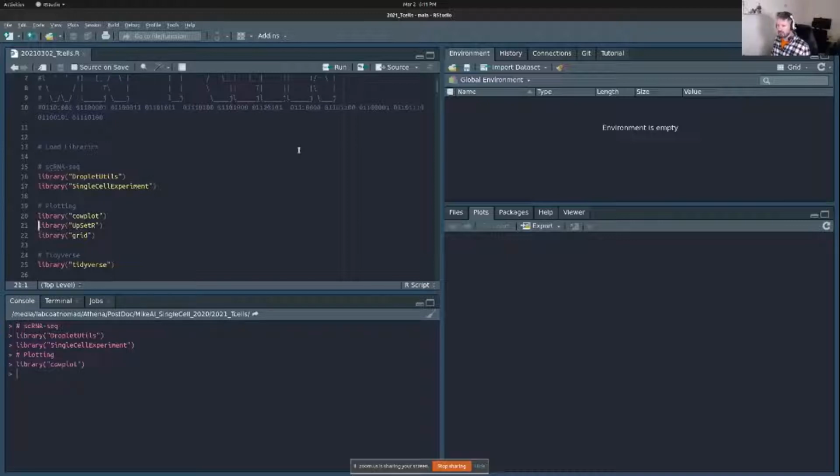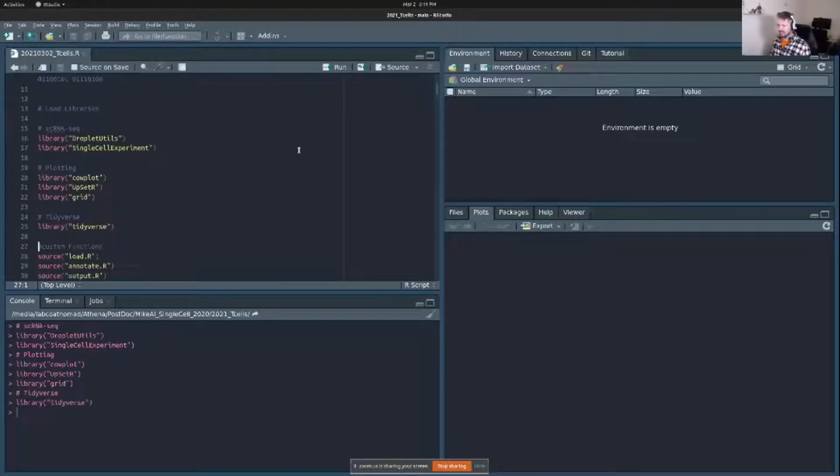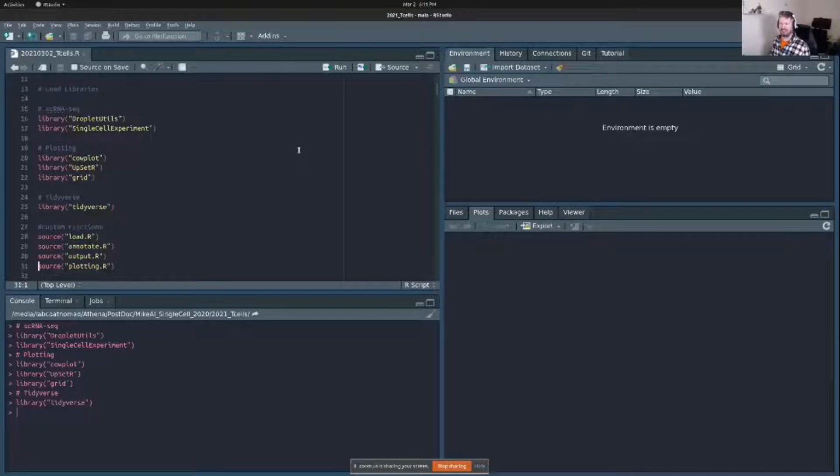You can use cowplot and use this for graphing. It's not important. If you like using patchwork instead for doing your graphs, use patchwork. They're all just ways to level out ggplots and put more of them on the other ones. Tidyverse to do my little scripting, data wrangling. Nothing super fancy there. I was a dplyr user for a very long time, but I've only really committed myself to actually going full tidyverse recently.